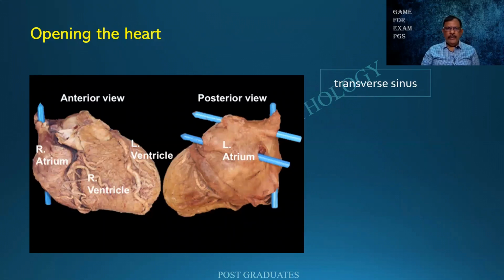Coming back to the opening of the heart, one structure I definitely know will be the superior vena cava and the inferior vena cava. These are perpendicular. So what I do is I keep these straight. The remaining heart falls in place. So when you are asked to show the anatomical position of the heart, this should be it. And there will be a slight tilt in the apex of the heart. This is the base of the heart. This is the apex of the heart. This is the coronary sulcus in which you find the coronary artery.